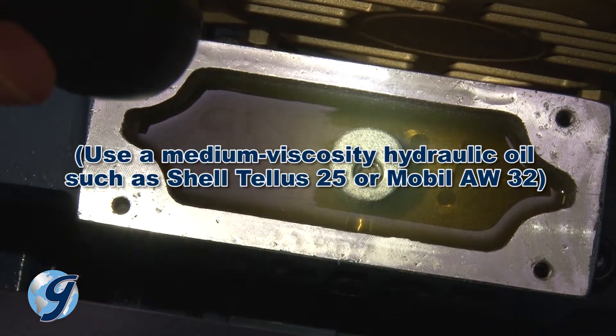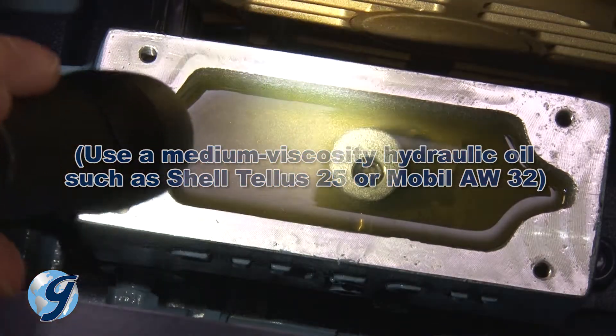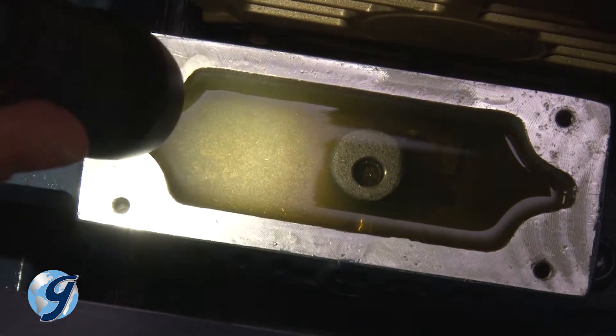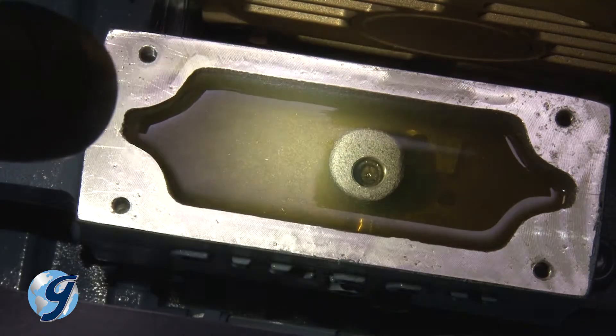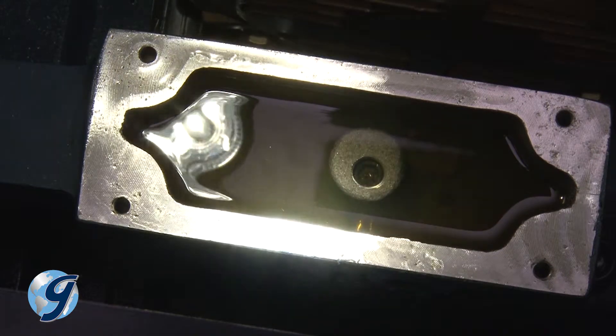If the oil level is low, add oil. Make sure the oil is clean. If you are working on an existing testing screen and the oil is not clean, or you have sludge in your oil reservoir, refer to your operating manual's section on draining and refilling the hydraulic system.